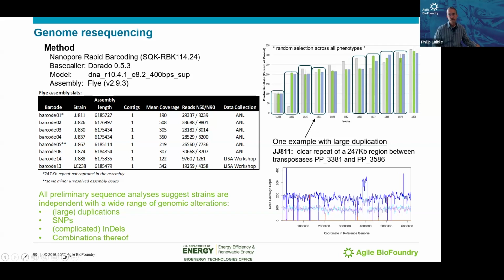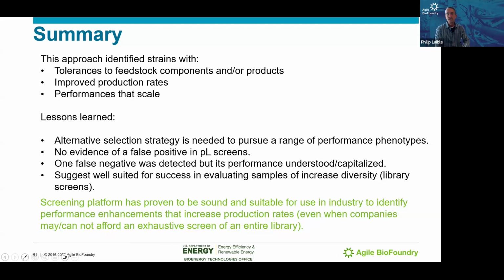from adaptive laboratory evolution. And this time was set up for high feedstock loading, but the next slide just reminds everyone that this approach could just as well be used to improve tolerances to your product, to intermediates, and other things that are coming along with the mix and the process. Maybe something you choose just to keep your costs down is not going to be as amenable to tolerance from the organism.